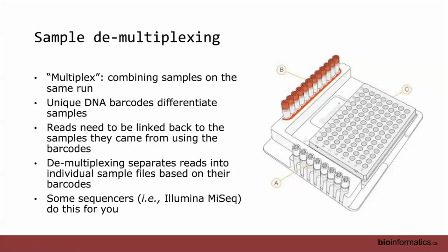People will sometimes combine different amplicons into the same sample. If you know that you're not going to have much overlap between amplicons, you could, say, have 16S and 18S with the same index for each of them, because within your 16S processing, you'll probably be filtering out the eukaryotes, and in your 18S sequencing, you're going to be filtering out any prokaryotes that you've found in there. So people sometimes do different things like that. It all ends up working fine in the end, typically.